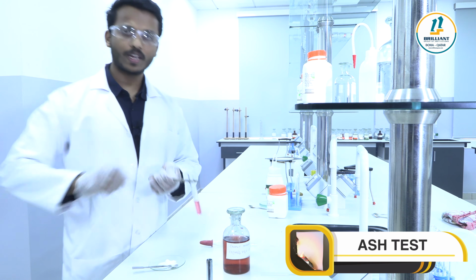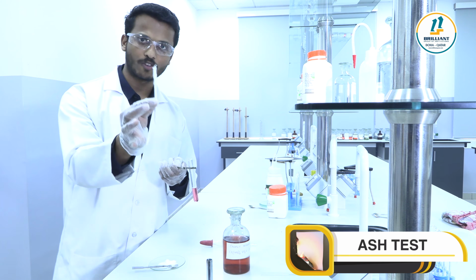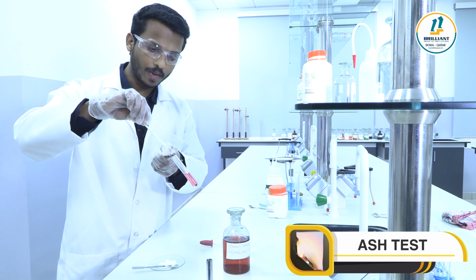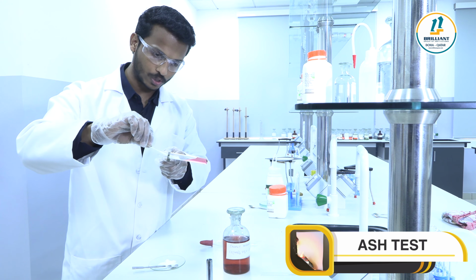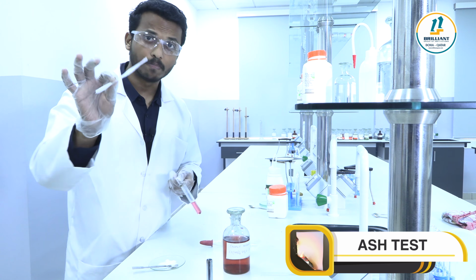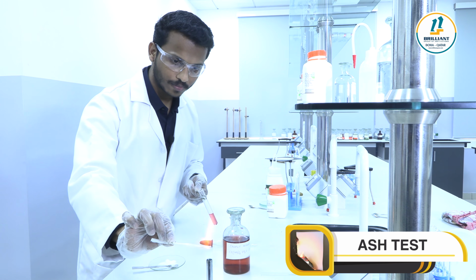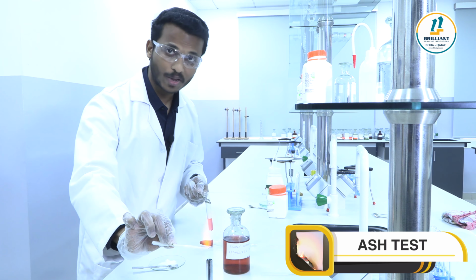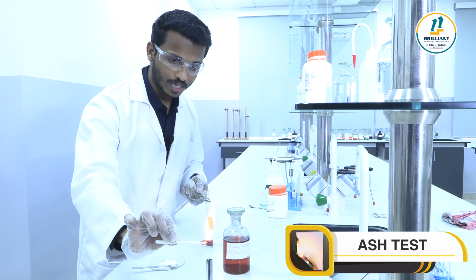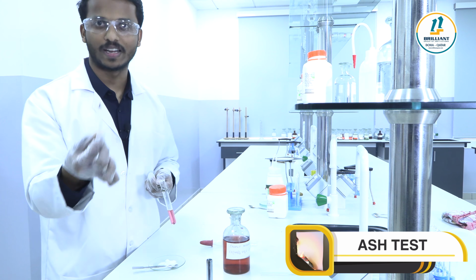After heating, take a piece of filter paper and dip it in the solution, make it wet. Now burn it into ash. Here we are not checking the flame color, we are checking the ash color. Now we can see an ash is generated.